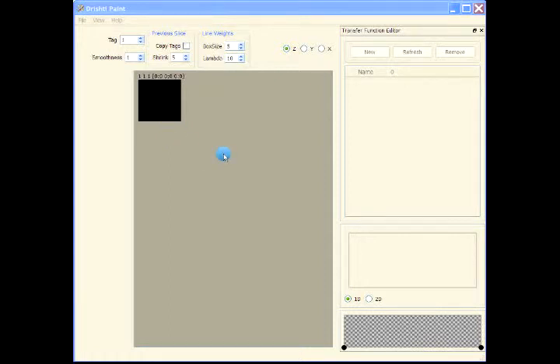This video will tell you about the Drishti Paint interface. Drishti Paint is the program for creating segmented datasets. It allows you to do slice-by-slice segmentation and painting on the slices.